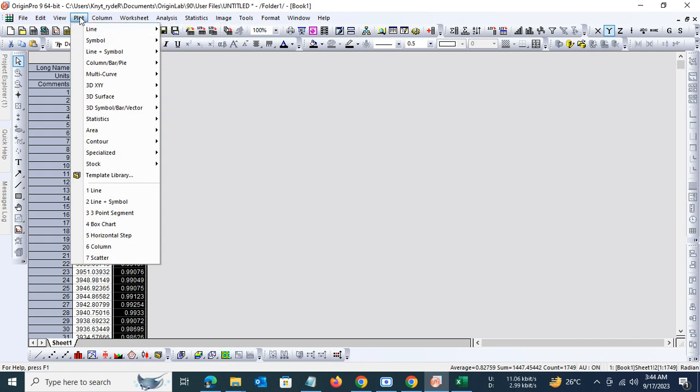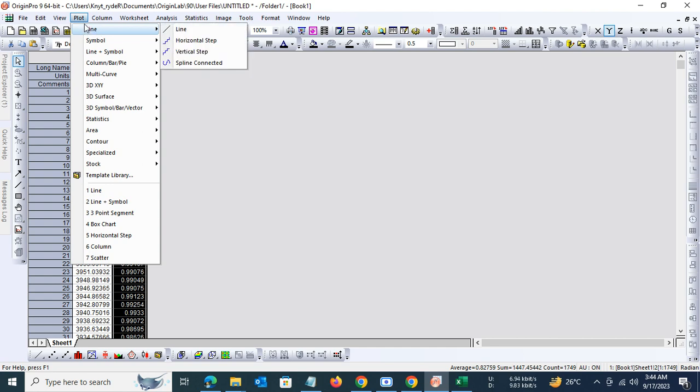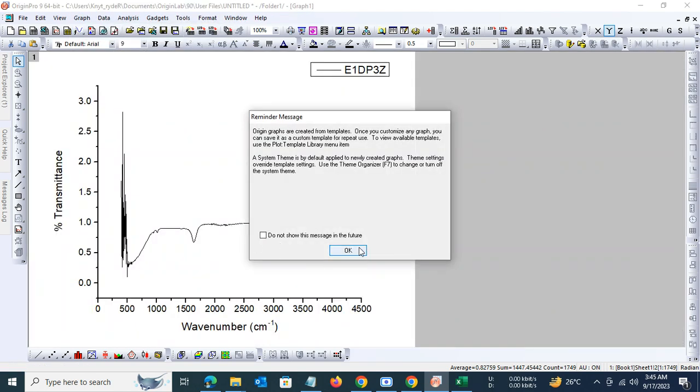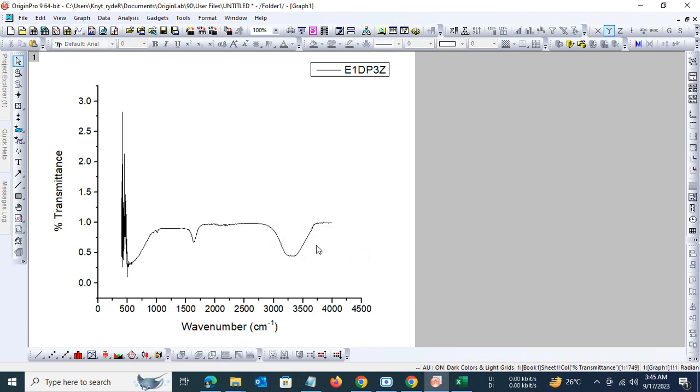Let us plot the spectra. We'll go to the Plot function, then go to Line and plot the graph. Now in the graph we see that the x-axis is running from zero on the left to 4500 on the right. This is not how IR spectral data is represented.